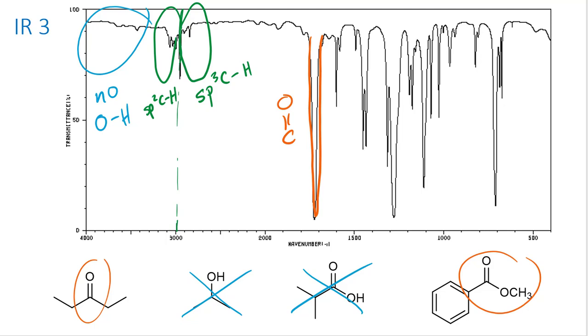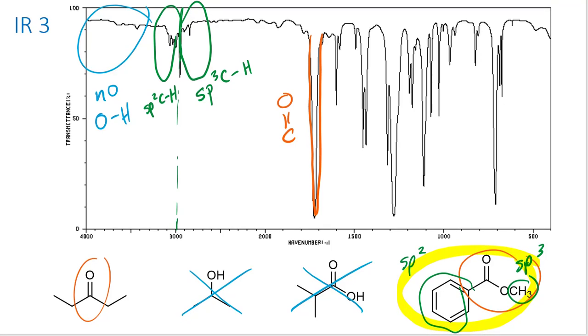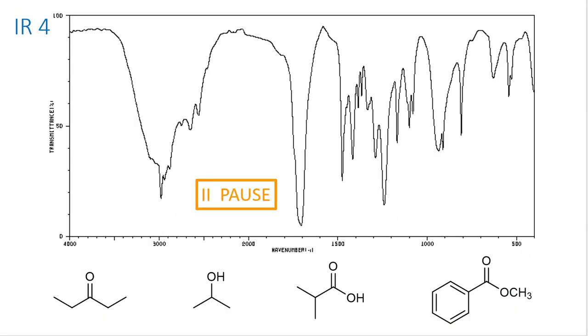And we do have both kinds present. We've got sp3 CHs in the methyl, sp2 CHs in the aromatic ring, and so the aromatic ring is going to fit this infrared structure the best. By process of elimination, this then must be the last, the carboxylic acid. See if you can rationalize that structure in terms of the peaks, or rather absorbances, present in the infrared spectrum.